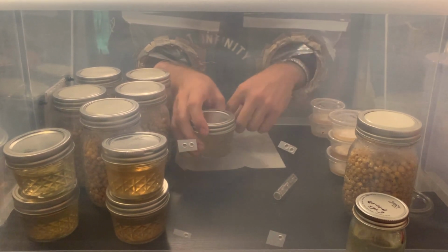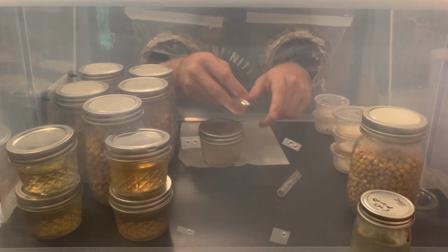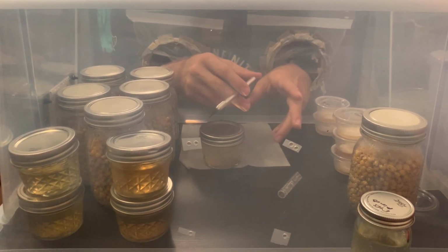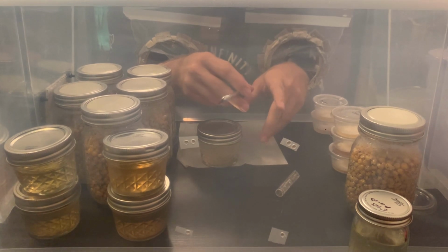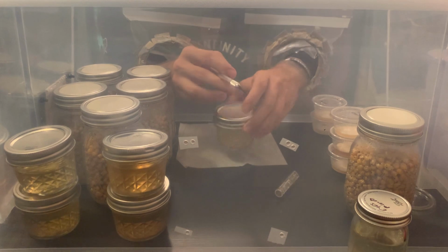So if you're using agar, you're gonna wanna get an X-Acto knife or your spore syringe, something like that, something that is going to be easy to use in here. Some people flame sterilize. I don't flame sterilize because that's just extra work.